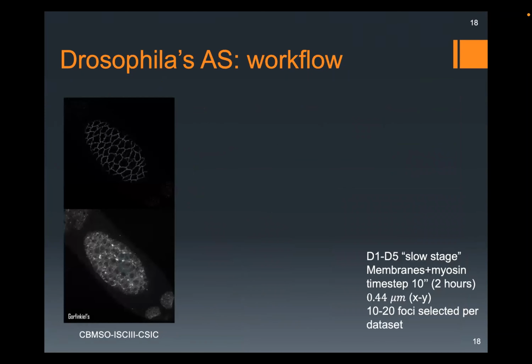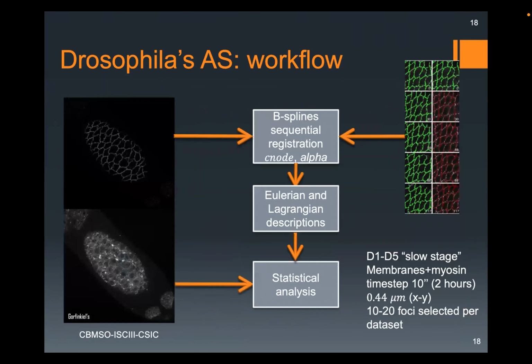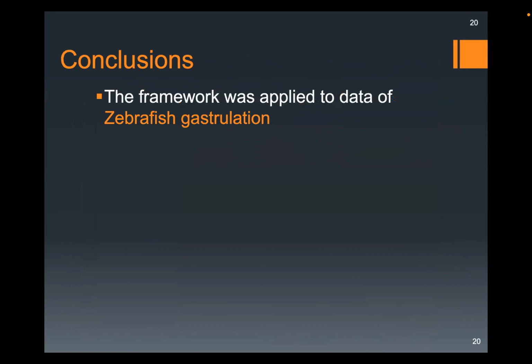Because if you see here the relationship between the cell deformation and the actomyosin, the image below is myosin marker, and you see different foci of myosin concentration. It's giving rise to a pattern that you can see here at the tissue level, but it's not at the embryo level. So for vertebrate generation, you need to have patterns at the embryo level.